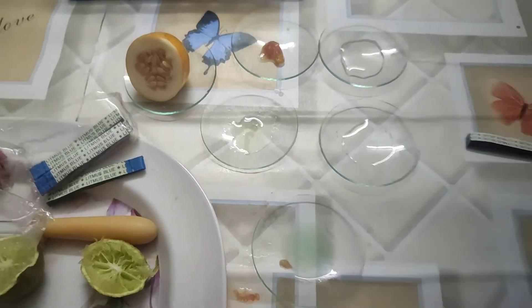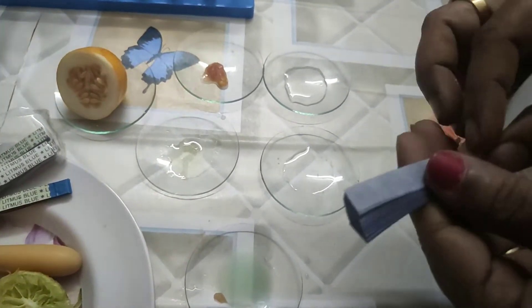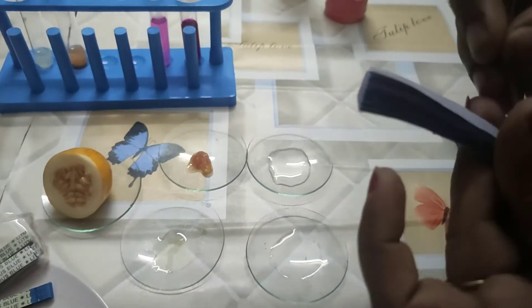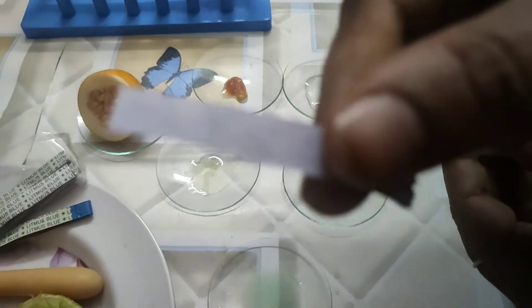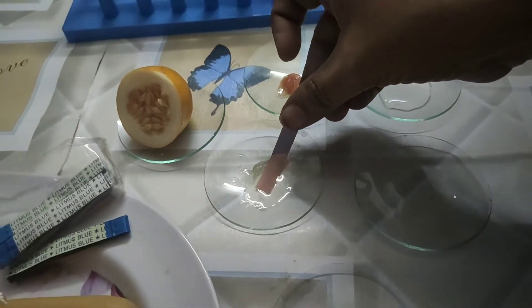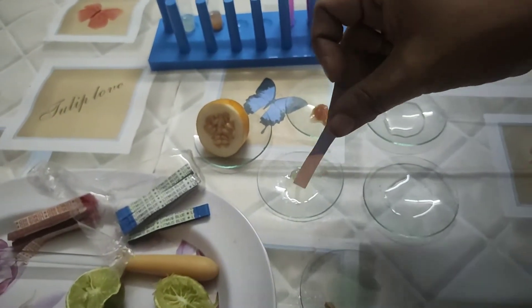Now we will test which substances contain acids or bases by using the blue litmus paper. This is a blue litmus paper — you can see it is very blue in color. We will check one by one. I dipped it in the first solution and the blue litmus changed to red.